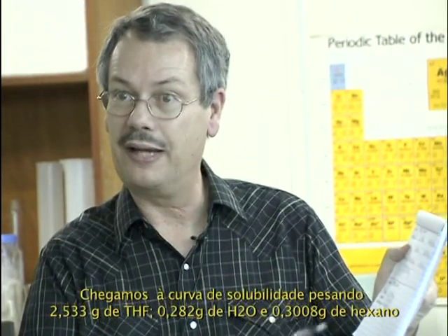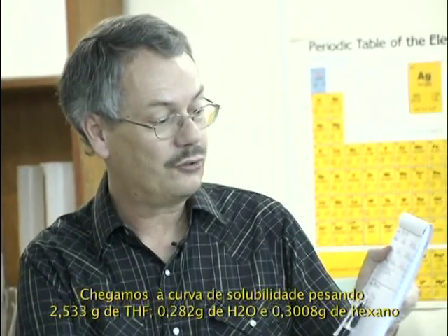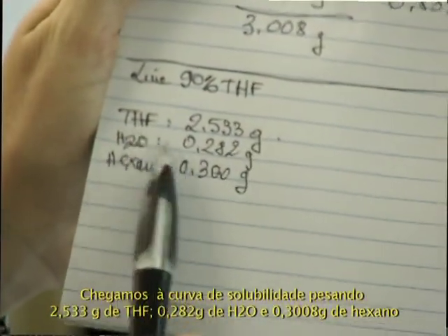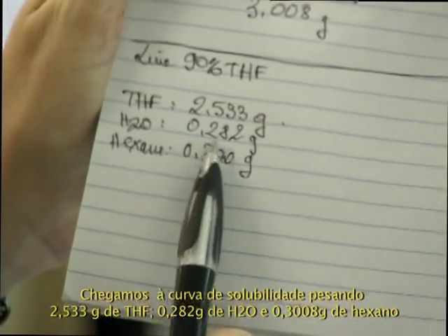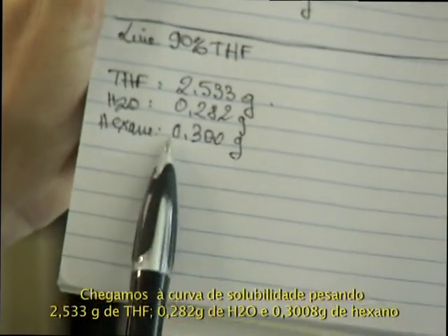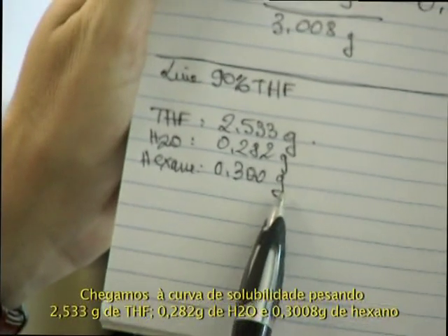So we got binodal curves weighting 2.533 grams of THF, 0.282 gram of water and 0.300 gram of hexane.